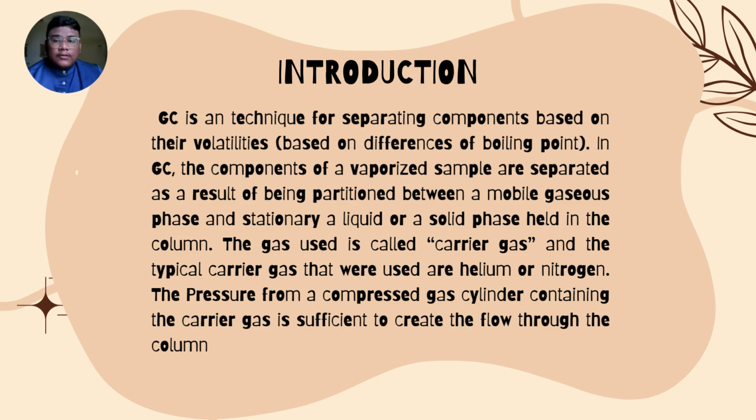So what is gas chromatography? To give you a brief introduction, GC or gas chromatography is a technique for separating components based on their volatilities or based on differences of boiling point.